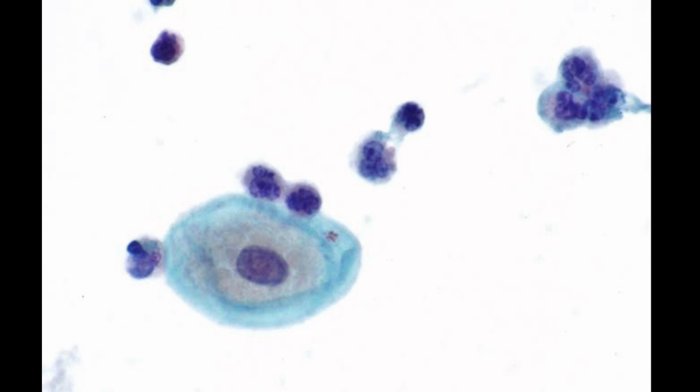Next, navicular cells are also cells found in the cervicovaginal smears. So these cells are boat-shaped intermediate cells with strong tendency to fold or curl on edges. Their presence suggests a combined estrogen-progesterone effect. They are found in the latter half of the menstrual cycle, during pregnancy, and also menopause.